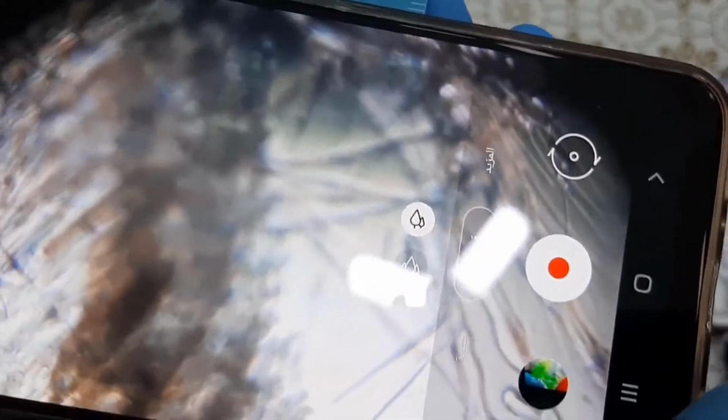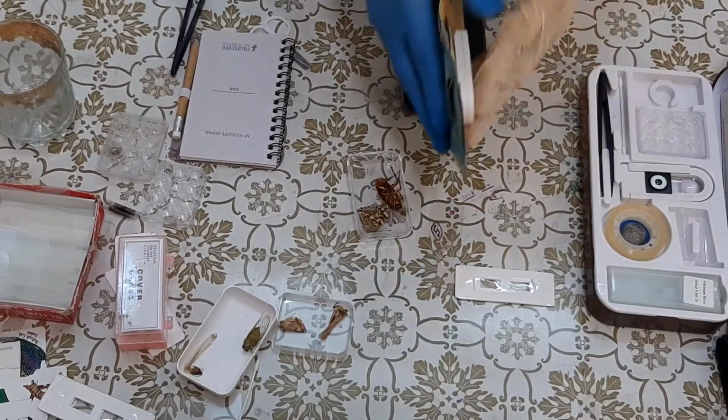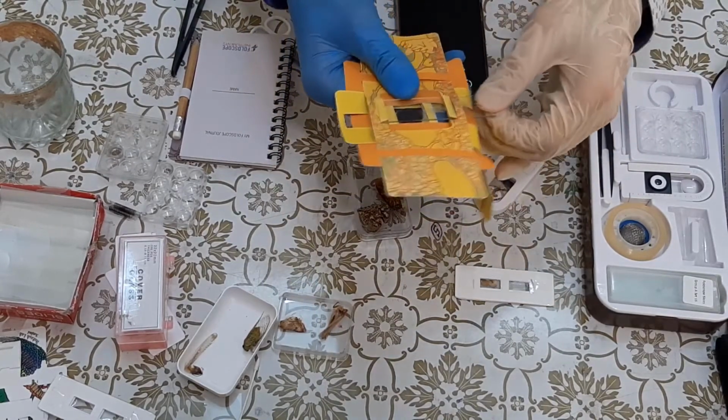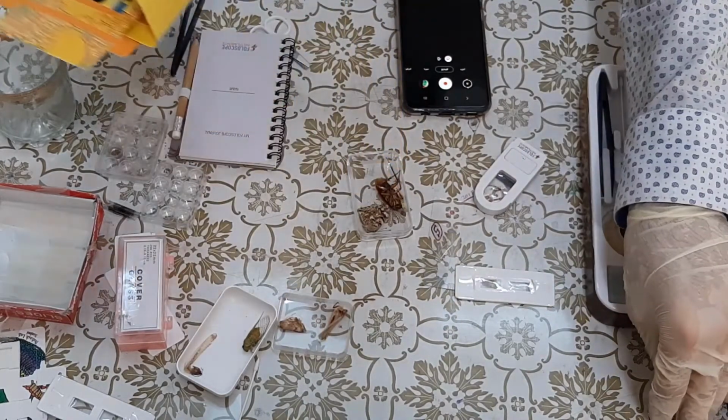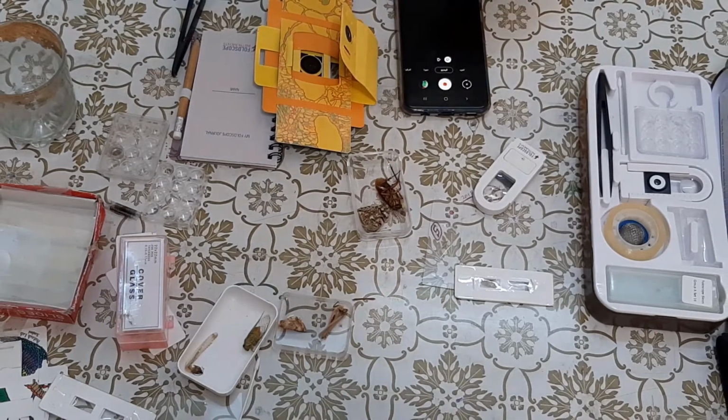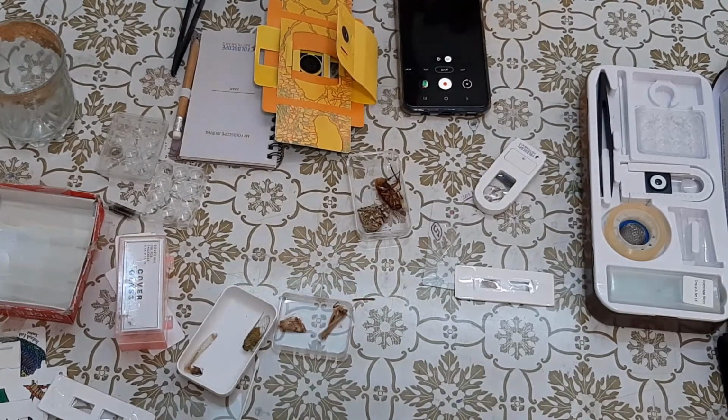These are, I guess, the filaments. This looks like the filaments of the wings. Yeah, that's it for now for this sample. Let's move on to the next one. Now we are done with the wing of the moth, and second I will have the wing of the grasshopper.